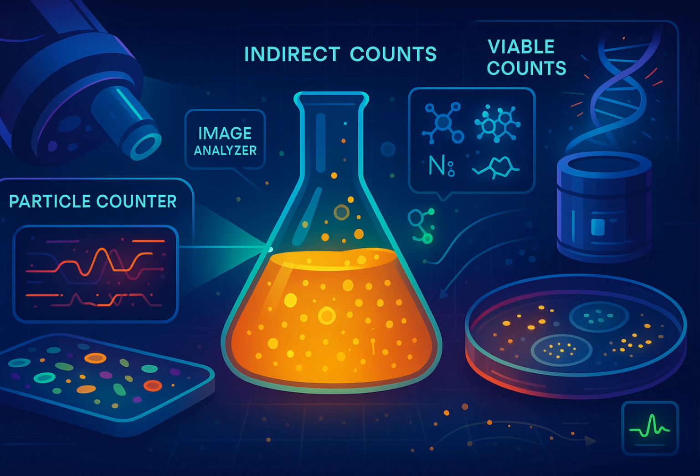That makes sense. It directly relates to the amount of fungus. So, pros and cons for measuring components. Pro: works when OD fails, in turbid or particulate samples. Cons: generally more work, more time than OD. Assays can be fiddly, subject to interference. Non-microbial sources of the component can be a problem, like insect chitin if you're measuring fungal chitin. And the amount in each cell isn't always constant. Right, it can vary with growth stage and conditions. So again, you absolutely need a standard curve relating your component measurement back to actual biomass or cell number determined under your specific conditions. Lots of calibration needed.